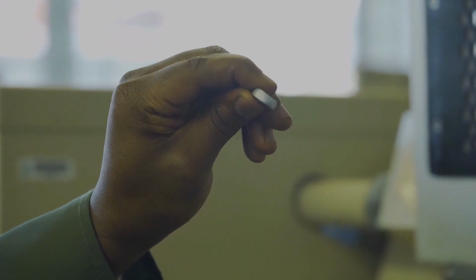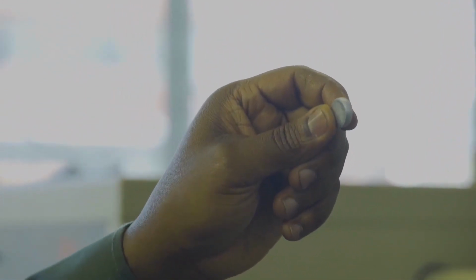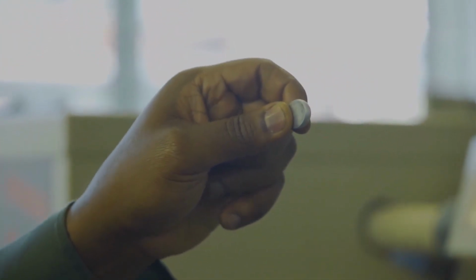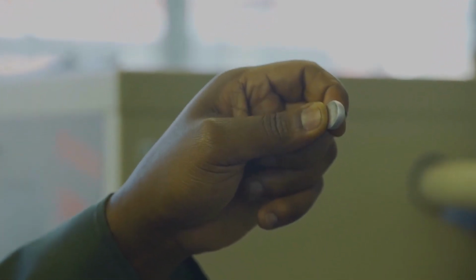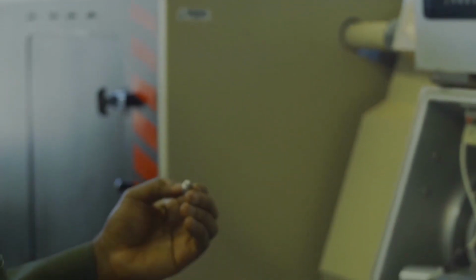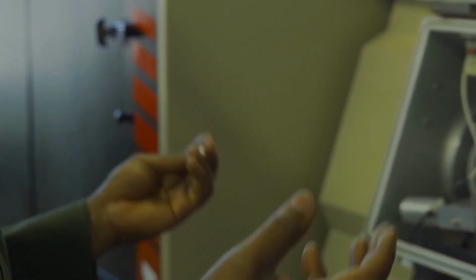So now we can carry out further studies by sectioning this sample into two, mounting it, and then observing the microstructure of this deformed sample. And the microstructure would give us an idea of the defects that might be present as a result of the deformation. It will also give us information about the mechanisms controlling the deformation. All this information we need to be able to shape metals into different profiles as we have them for different engineering applications. So that's the end of the flow stress test.